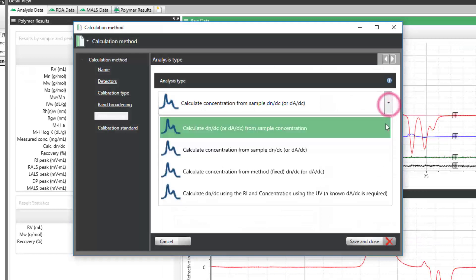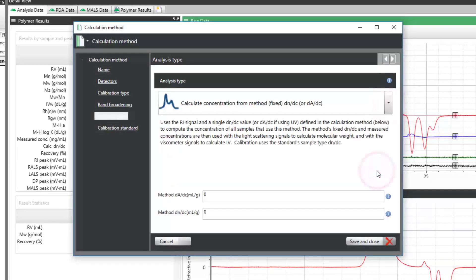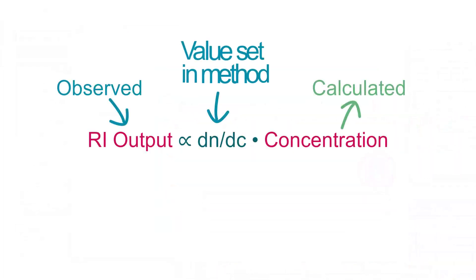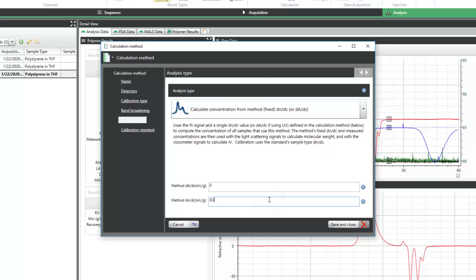The third, Calculate Concentration from Method or Fixed DNDC, is similar to the previous analysis type in that it uses a known DNDC value. But in this case, the DNDC value is set in the method and the same value is applied to all samples analyzed with that method.